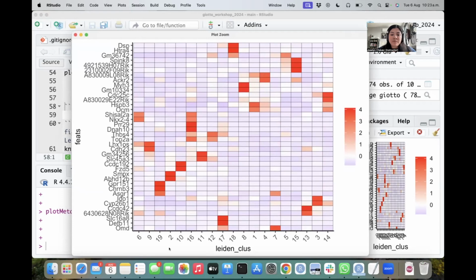And basically, each of those options allows you to visualize in different ways the same information. So the idea in general is the same, just comparing the expression of these top genes between the different clusters. So probably this is something that facilitates the comparison more, right? Usually the heat maps are very, very useful.